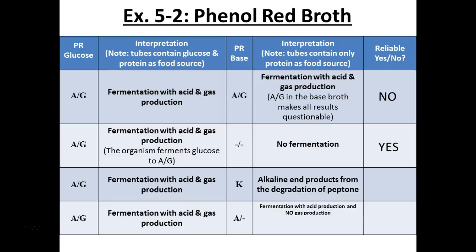Now for the next one, could they, given protein, do nothing? Yeah, Tamara and Annie's ones would do that, right? They would be like, pfft. Or no, everyone else's but Tamara and Annie would be like, I give up. No sugar. Yours would ferment. But given the choice here between sugar, so this would actually be Adam's organism, right? Given the choice, it ate the sugar, fermented it, produced gas, and then when you gave it protein only, he's like, okay, fine, I'll eat the protein. Fine, I'll eat it, right? This is possible.